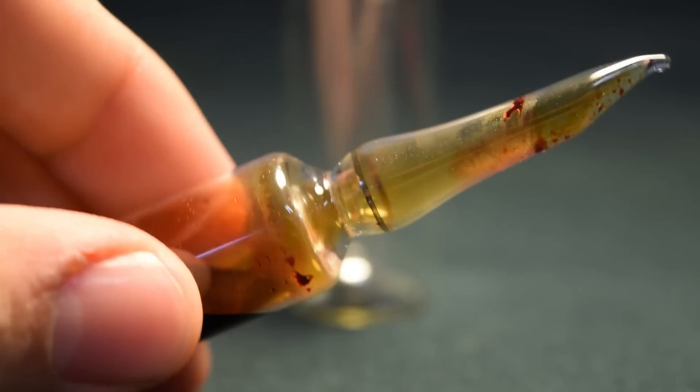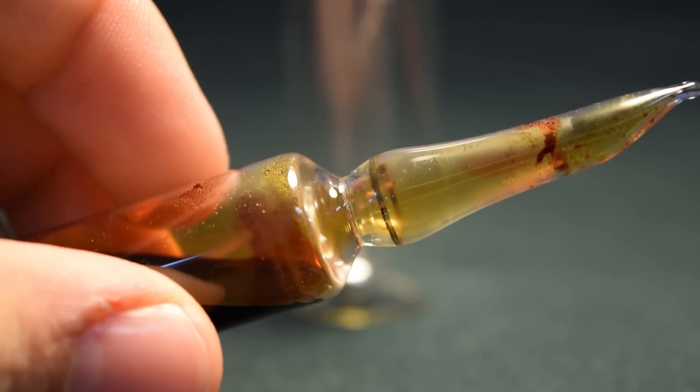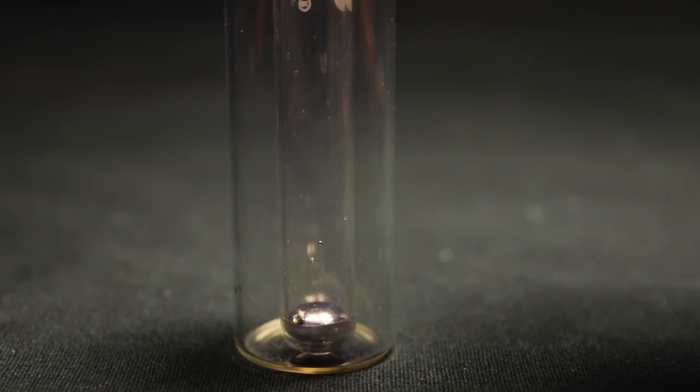Now it's time to open up the bromine ampule. This ampule has been pre-scored, so it's pretty easy to just break off the top. I'm using a glass pipette to put in a few milliliters of bromine over top of the mercury.